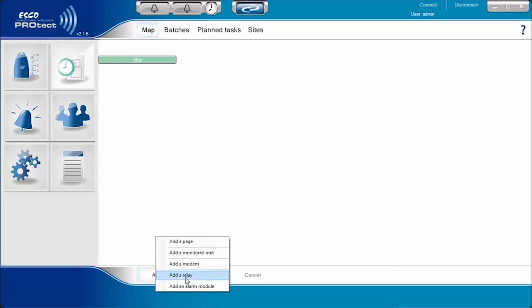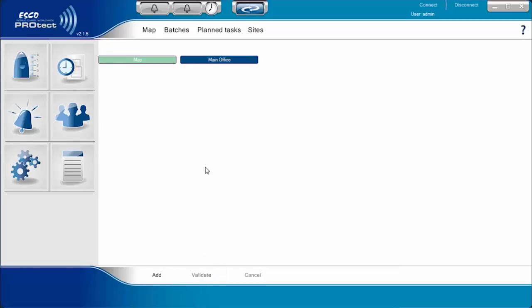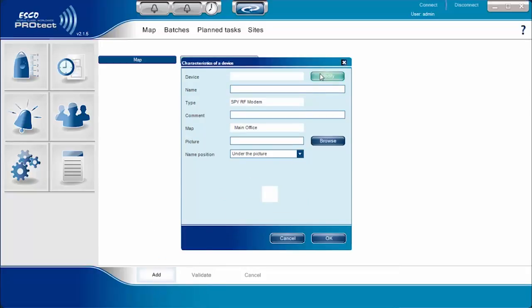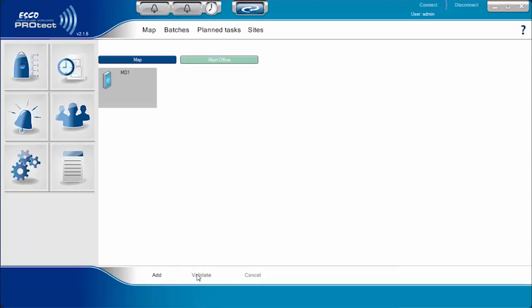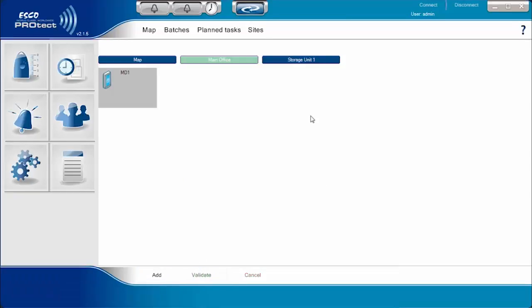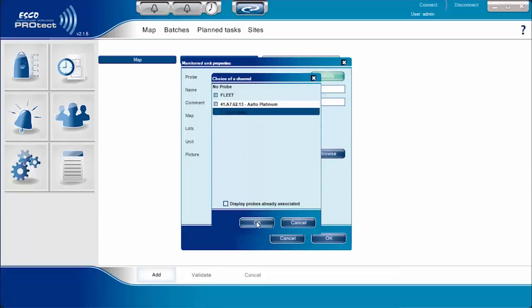To define the specific location of different ProTech devices connected within the facility, the user needs to create a page to represent the location where the ProTech device is connected. In this menu, the MD-1 is connected to the main office, while the ProTech UN-1 is directly connected on the freezer unit at the storage room.